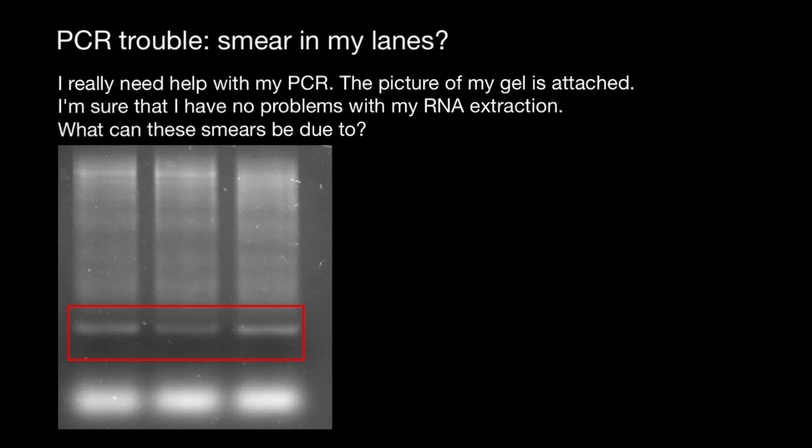When you see some artifacts like this — a smear on your gel — it's not necessarily a problem with your gel electrophoresis or how you run it, but sometimes it can be due to some mistakes you made during PCR. So here's a question: 'I really need help with my PCR. The picture of my gel is attached. I'm sure I have no problems with my RNA extraction. What can these smears be due to?'